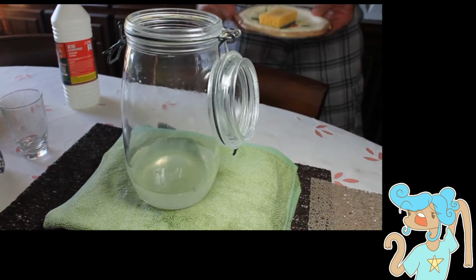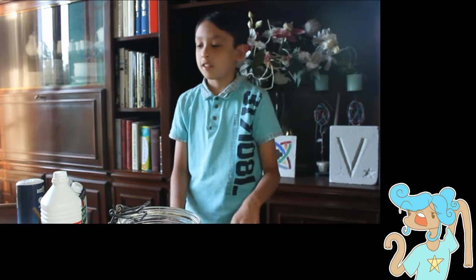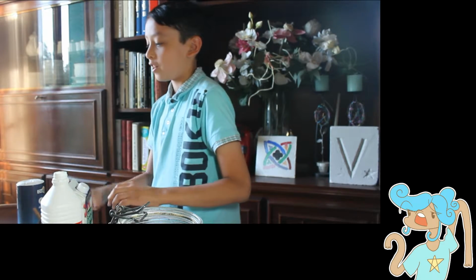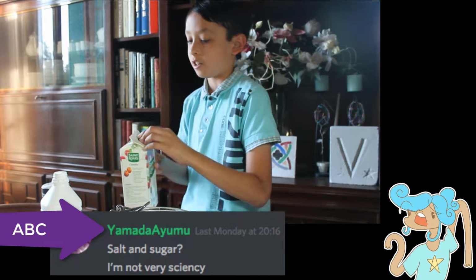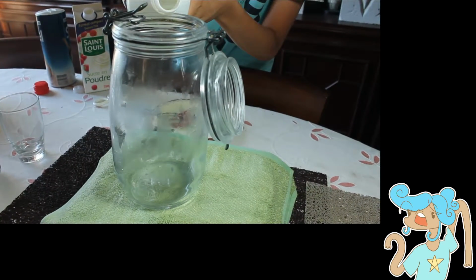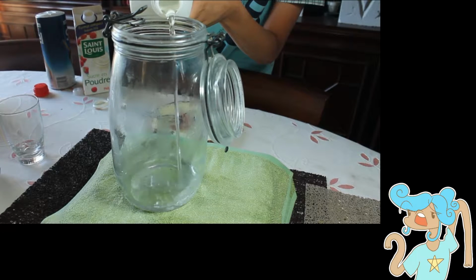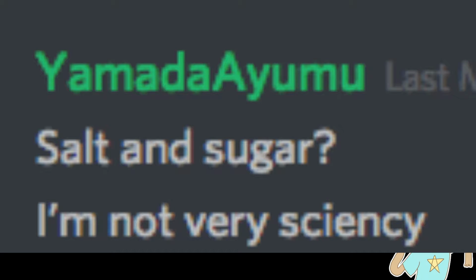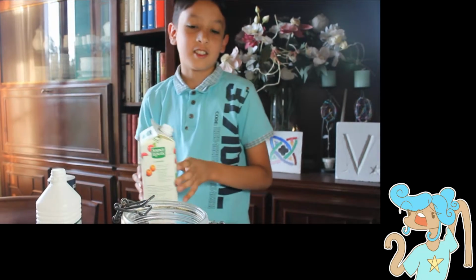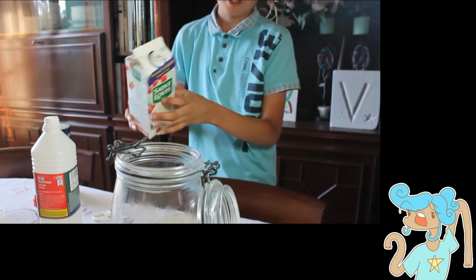Next experiment. Okay, so the next experiment was suggested by Yamada Ayumu on my Discord server. You put the acid first, because remember we emptied it. Alright, so the shout out is to Yamada Ayumu, on your Discord server. It's like a chatting thing.